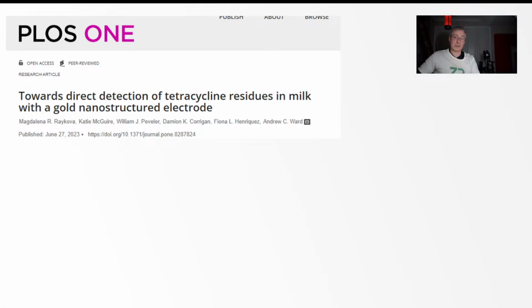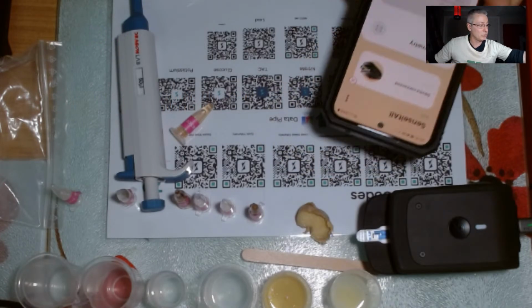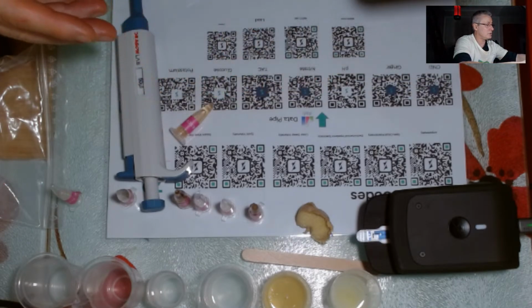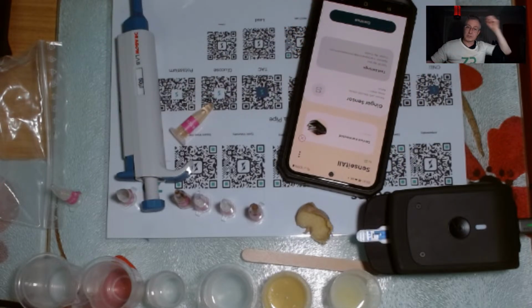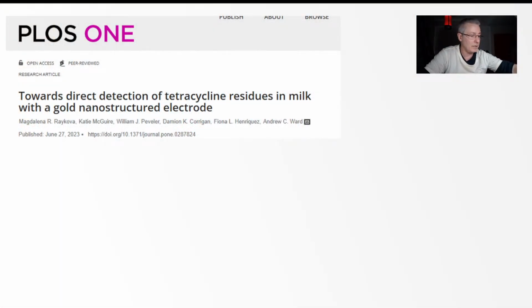Now, I'm super biased, but I'm going to do a demonstration in a minute. In fact, I'm going to move from my amperometry mode and go slightly into ginger mode. So now I'm in ginger mode. I want to show in this particular demonstration, this is not a super nice sample. Admittedly that camera's a bit small. This is not super transparent. It's a bit of a milky suspension that I've got. It's actually fresh squeezed ginger. But hold with me and let me get back to what I'm meant to be talking about.